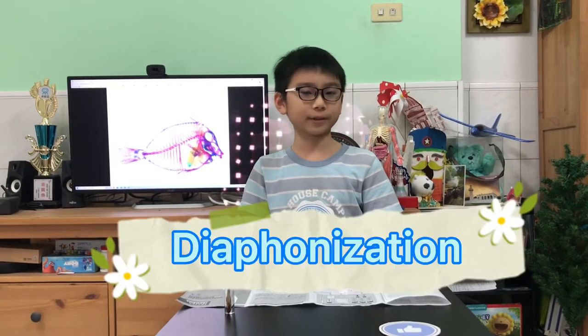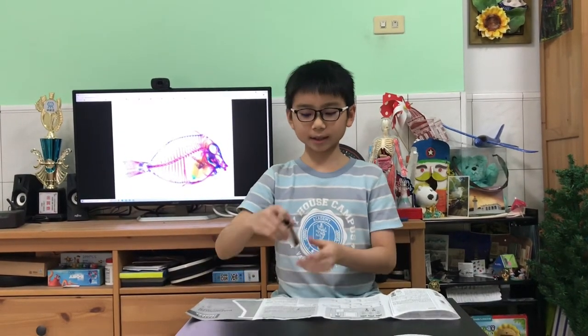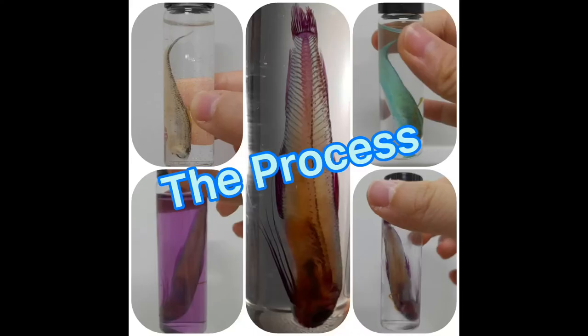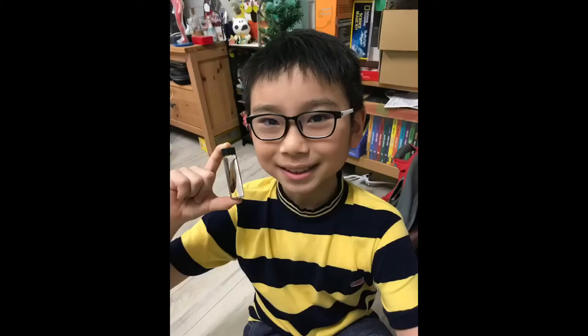Hello everybody, I'm Ryan and welcome to Science Lab. Today I'm going to talk about diaphonization. It is a scientific method where you use trypsin to make the muscle tissue of a species transparent, and you can dye the bones inside the specimen — just like this diaphonized fish right here. This is the process of me making the diaphonized fish, which lasted lots of days and weeks.